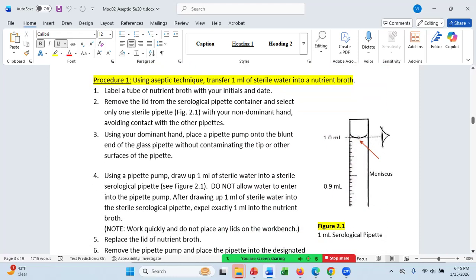There's a problem when you're transferring water, and that is the water does not sit in the pipette in a straight line across. It forms a meniscus in either a burette or in the pipette. That's because the water adheres to the sides of the tube. You might remember water has adherence from the lecture. And that makes the meniscus, where the water will be higher up at the sides than at the bottom.